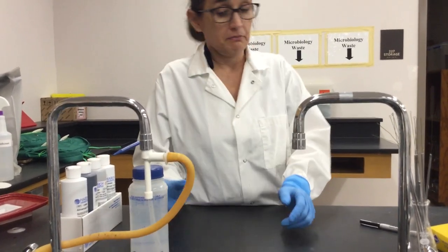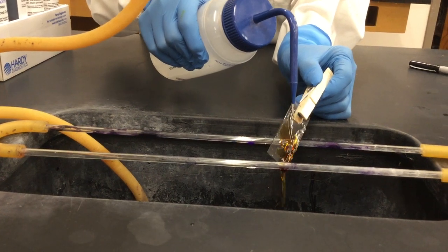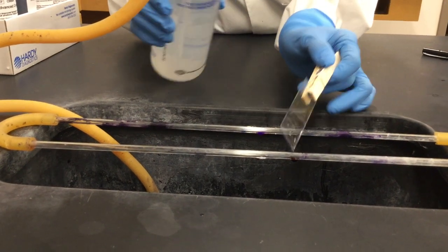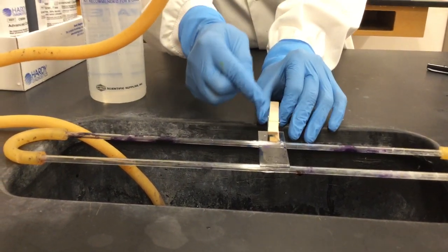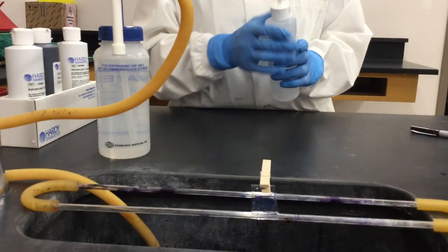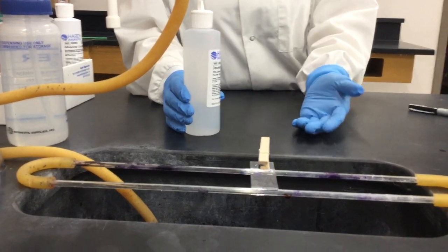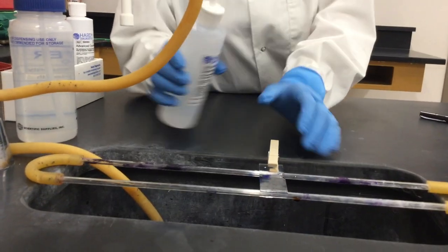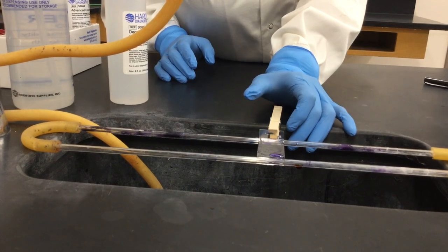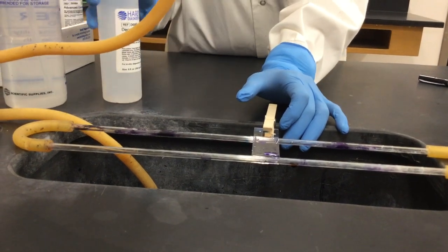So I think a minute has passed by. So let me just check out the excess of the iodide and then angulate it to the front and the side, so I don't have reagents spilling over the clothespin. And then this one is very critical, only 10 seconds, no more than that. Why? Because you don't want to under decolorize or over decolorize your slide. Okay. So that's 10 seconds.